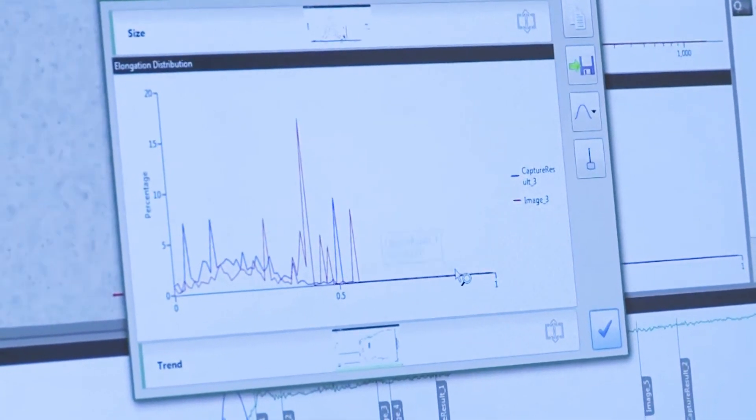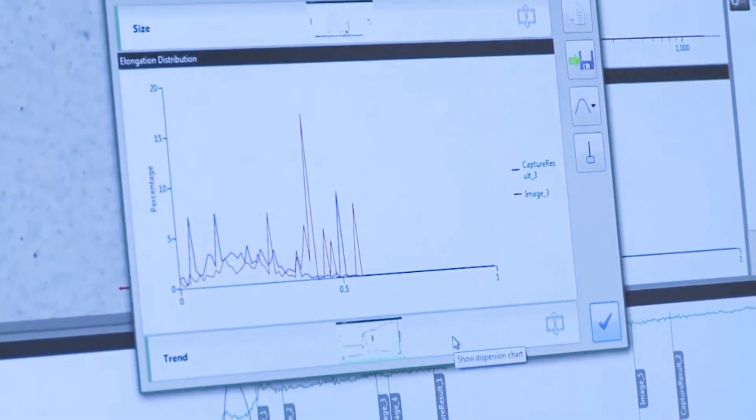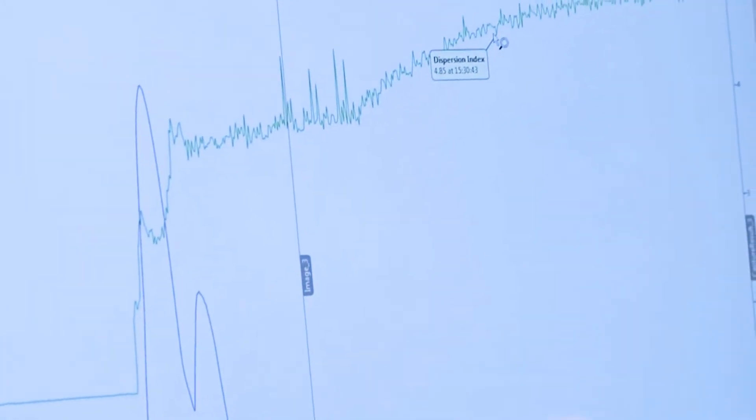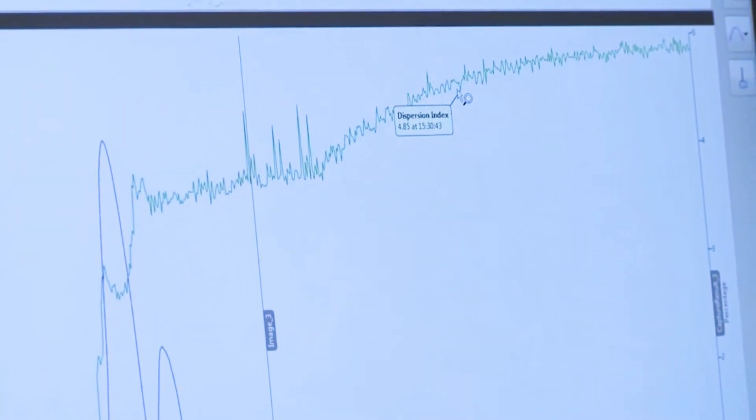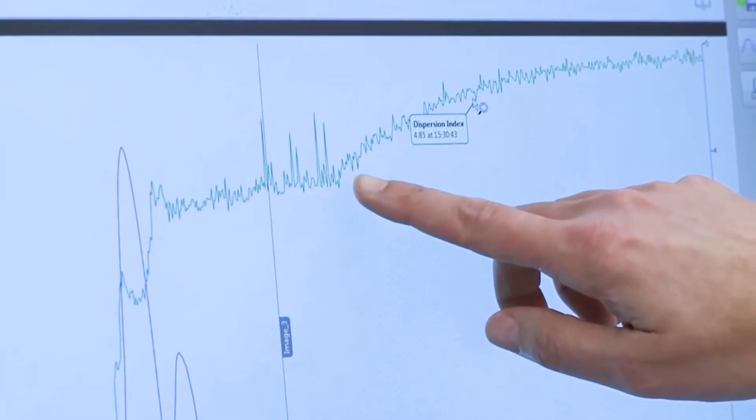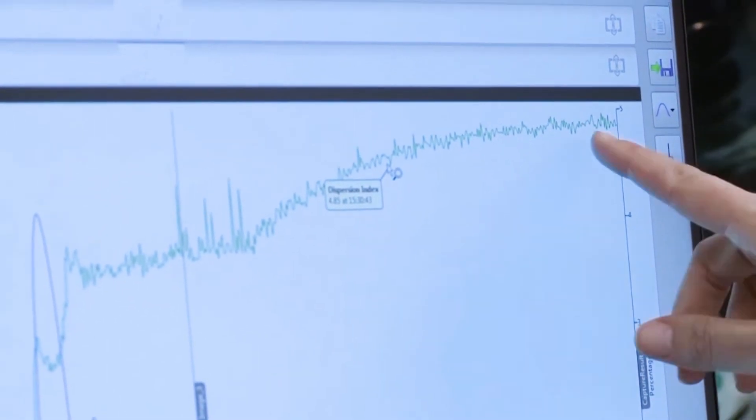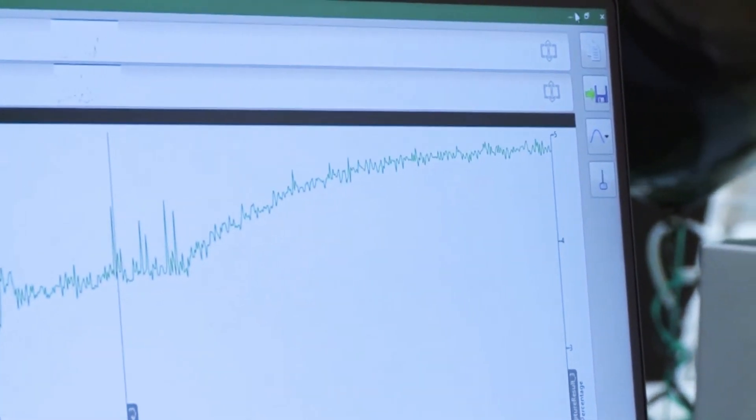We can also compare elongation to see if there's any change, and we can have a look at that dispersion index. So we can see when you put the sample in, there were quite a few changes there. And then as you turn on ultrasound, we can definitely see a steady increase in the dispersion index. Now it looks to me like that's starting to level out.